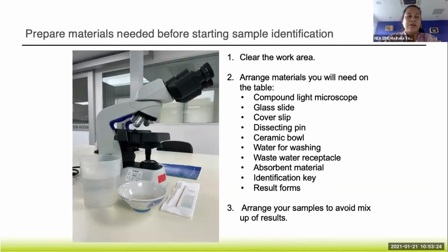But there is a risk to using the moist chamber. If you don't do it properly, then you actually run the risk of, because this is a high humidity chamber, having your samples damaged by molds. The parallel band is actually a character for many mosquitoes, not just Aedes. However, when you combine it with the characteristics that define a mosquito as Aedes, then it becomes a very specific characteristic for certain species of Aedes, such as Aedes malayensis.